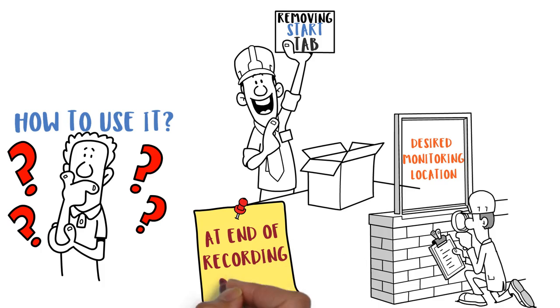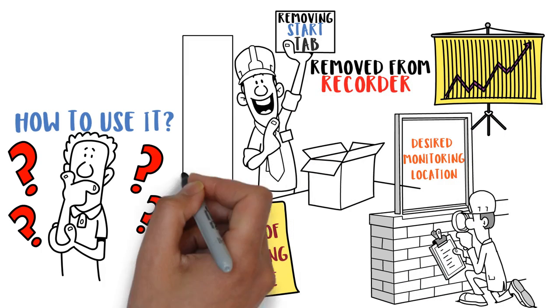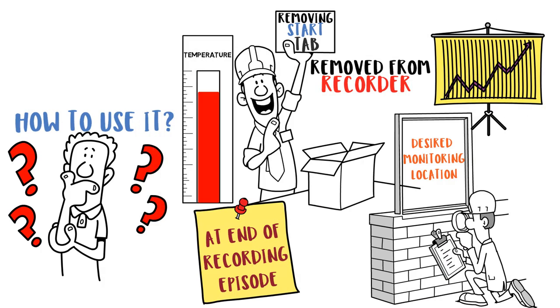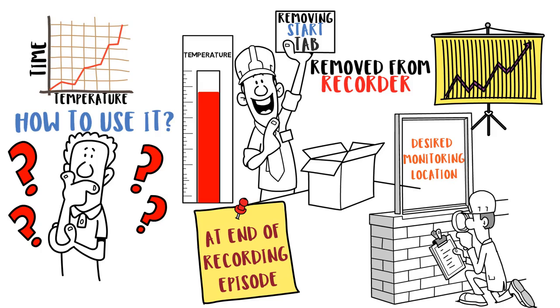At destination or at the end of the recording episode, the chart is removed from the recorder and the temperature history is reviewed. Temperature vs. time is clearly graphed on a narrow strip of pressure sensitive paper.